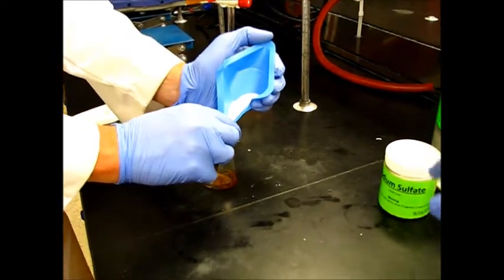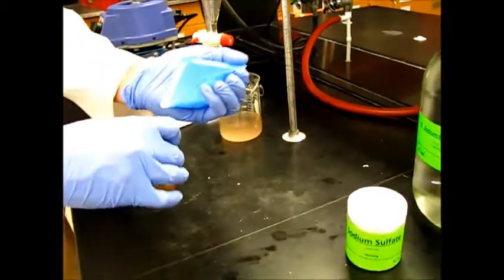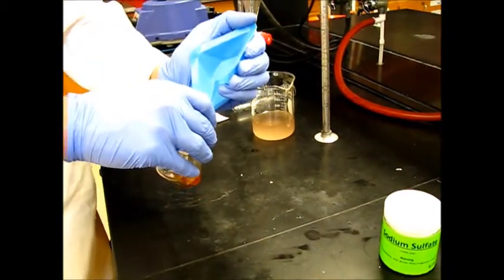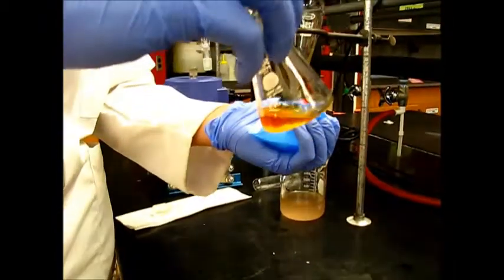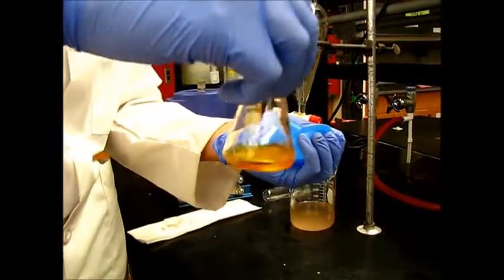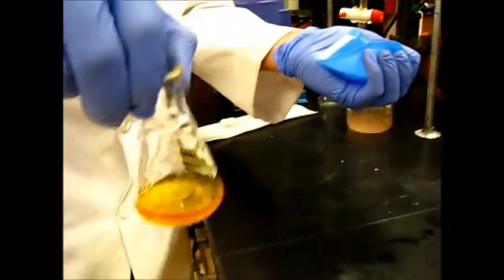This is sodium sulfate? Yes, this is sodium sulfate. You want to add it until it doesn't clump up anymore at the bottom. Once there's stuff floating around, then you know you're good. That looks to be pretty good. You can see there are particles that aren't clumped together.